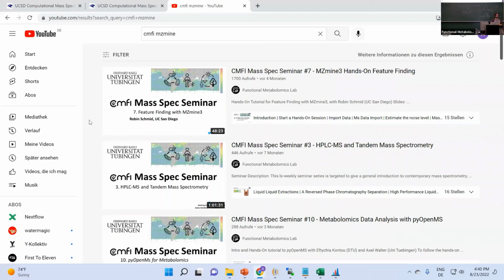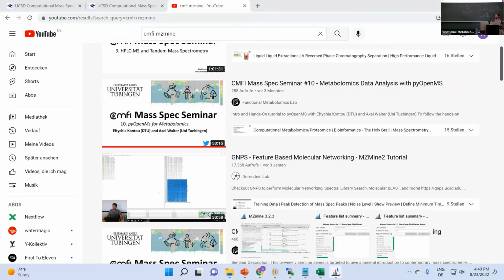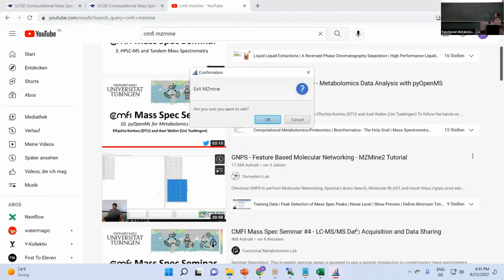We usually do it downstream in R and Python and all the other tools. It's a bit more flexible because people want to customize it. Yeah, okay, that's it. So definitely highly recommend this, and I guess we're going to put it out later as some more resources. And we're going to finally give over the stage to Axel.